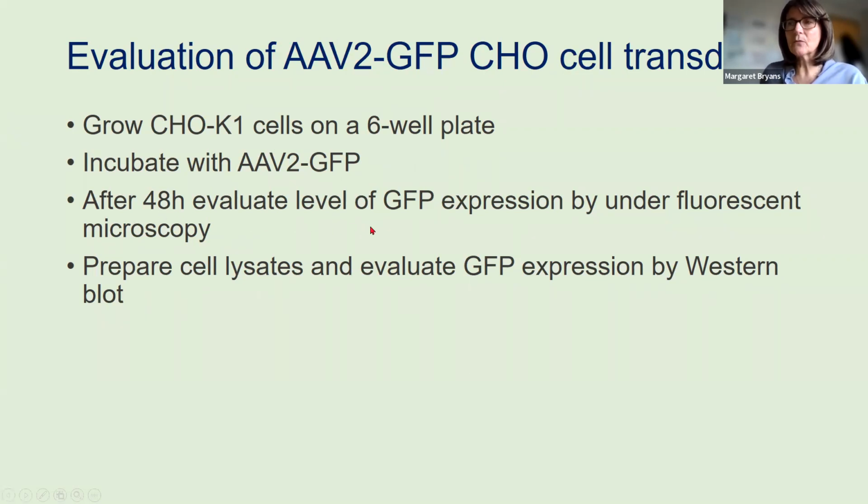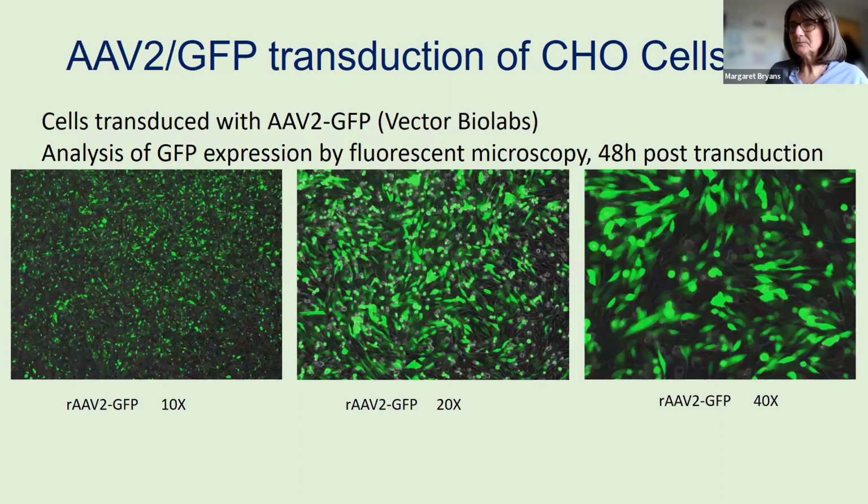After 48 hours, we evaluated the level of GFP expression under a fluorescent microscope. We also prepared cell lysates using typical RIPA buffer preparation of a lysate. We ran an SDS-PAGE and analyzed GFP expression with Western blot.